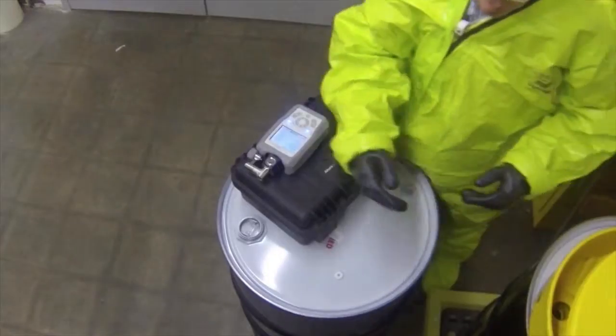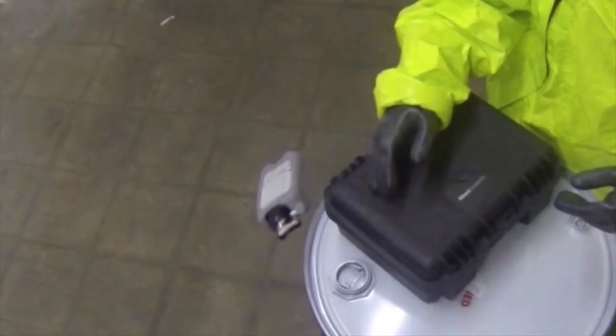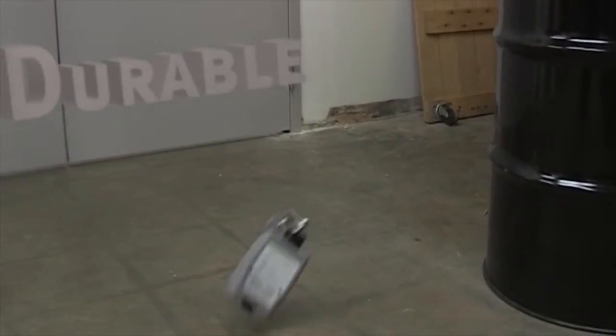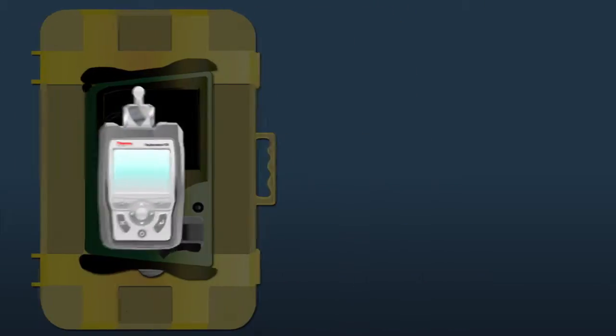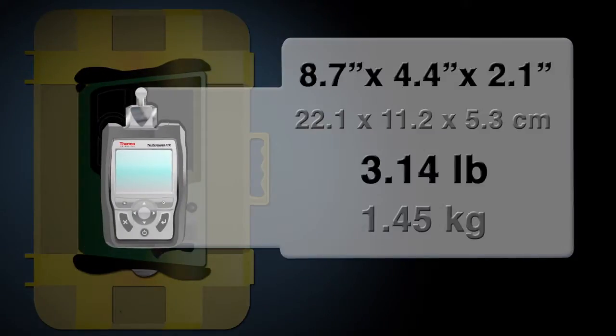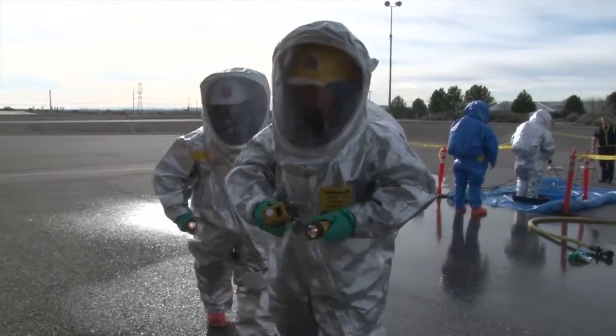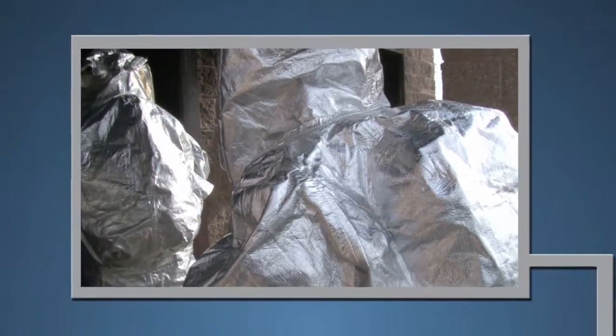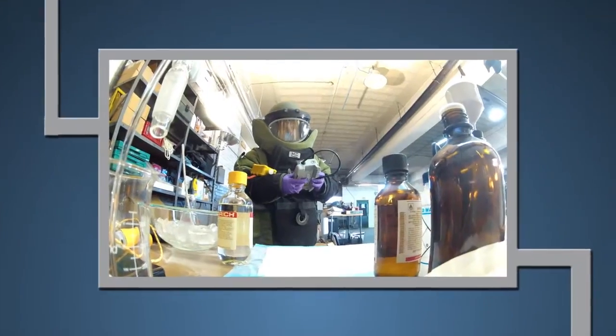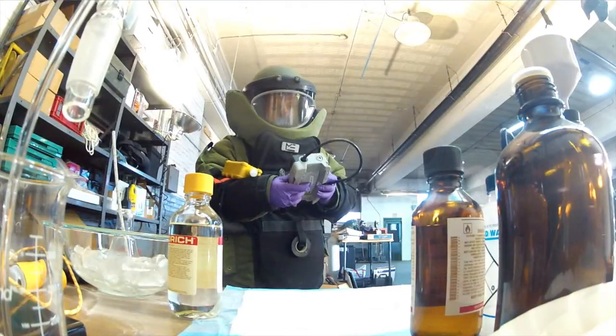We understand how and where our instruments are used. Given our customers' missions, durability isn't an option—it's a necessity. TrueDefender FTX remains the smallest and lightest military-rugged FTIR on the market. This has a direct impact on situational awareness, allowing responders to carry more tools into the hazard zone.